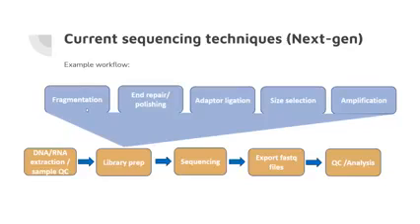All right, so to get from a piece of DNA that you've picked out of a cell to actually analyzing that specific DNA, we have to first sequence it and prepare it for sequencing. And there's a few steps in between. So first you have to prep it for sequencing, and that includes first fragmenting the DNA sequence, because when you pick out a piece of DNA from a chromosome, it could be hundreds of thousands, if not millions of base pairs long. And that's not really ideal for us.